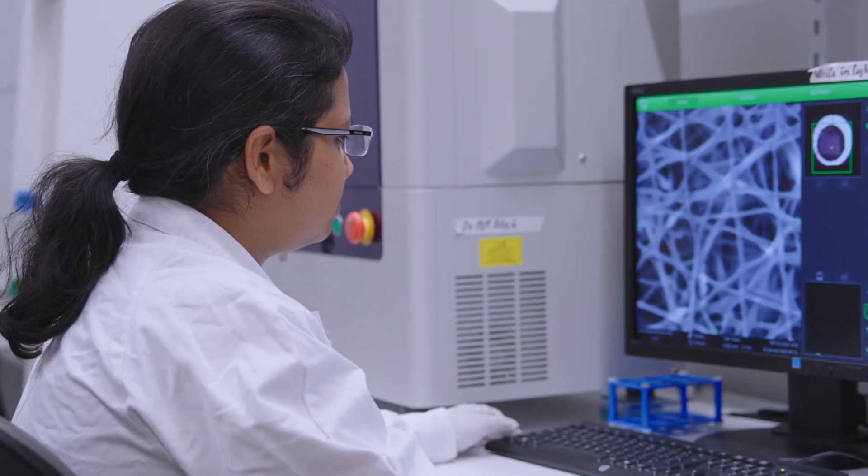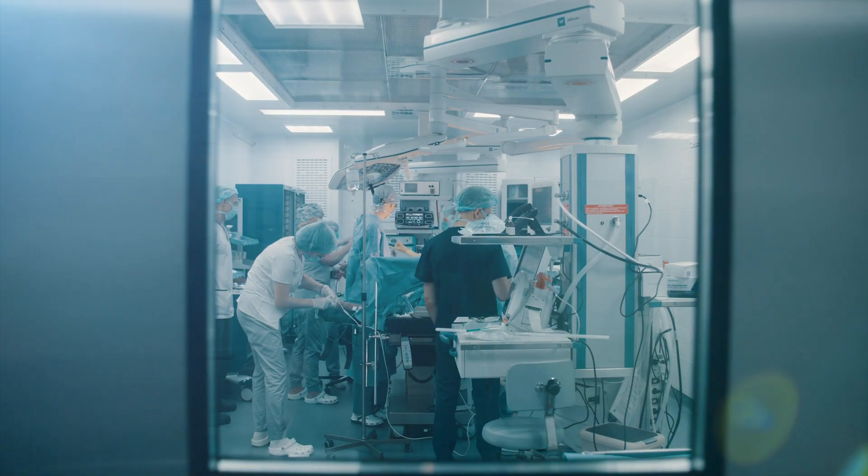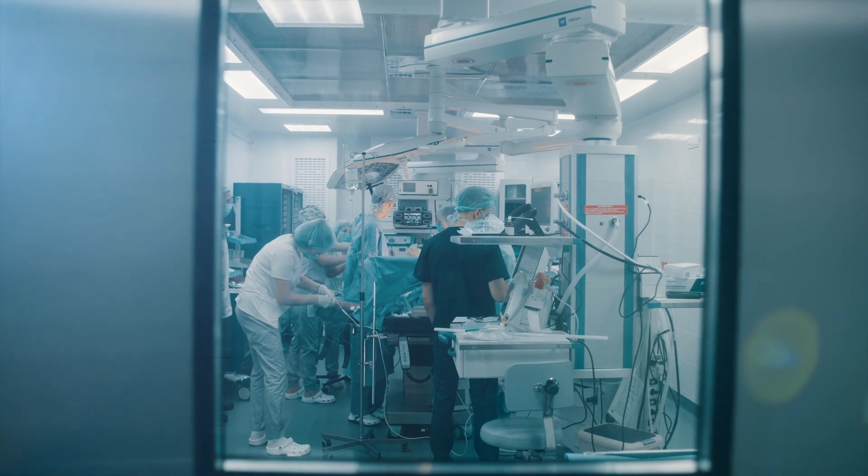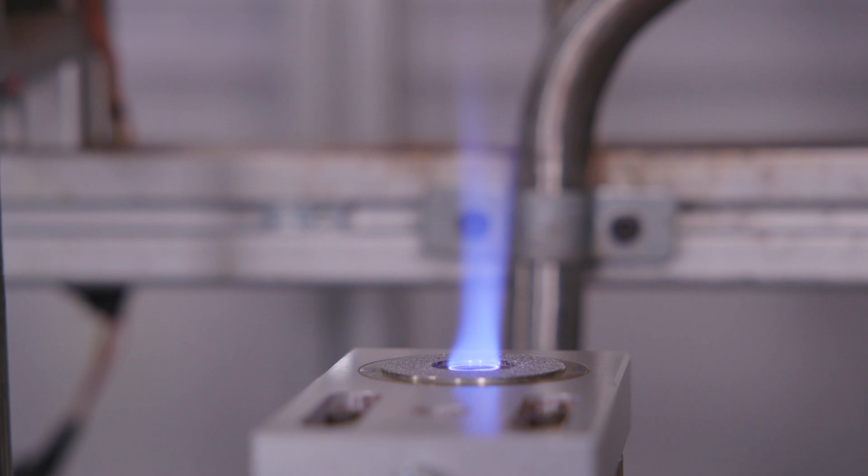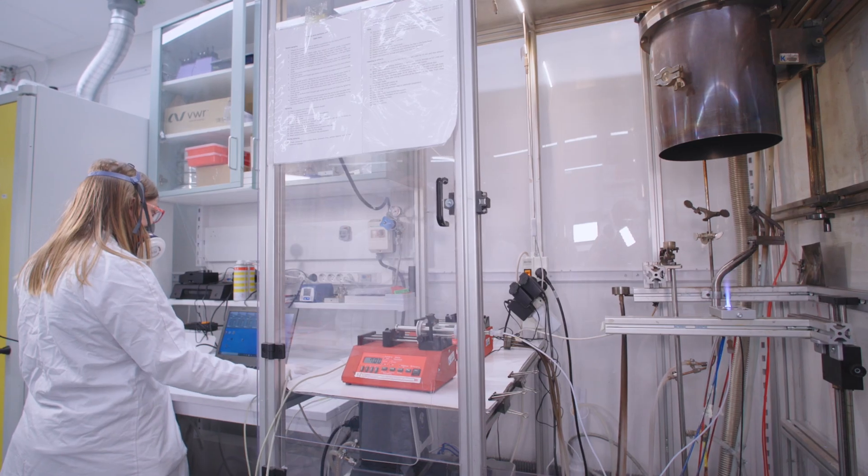The goal is to bring the nanoparticles to the market and help patients in the clinics. A key to reaching this goal is the flame reactor which makes it possible to produce nanoparticles on an industrial scale.